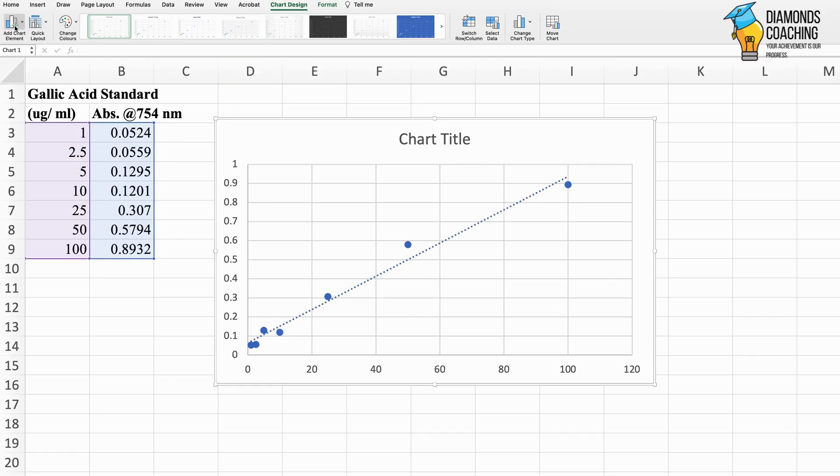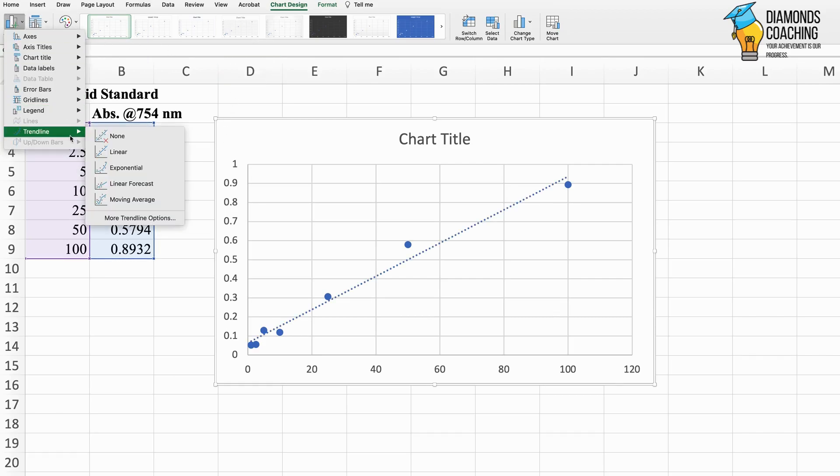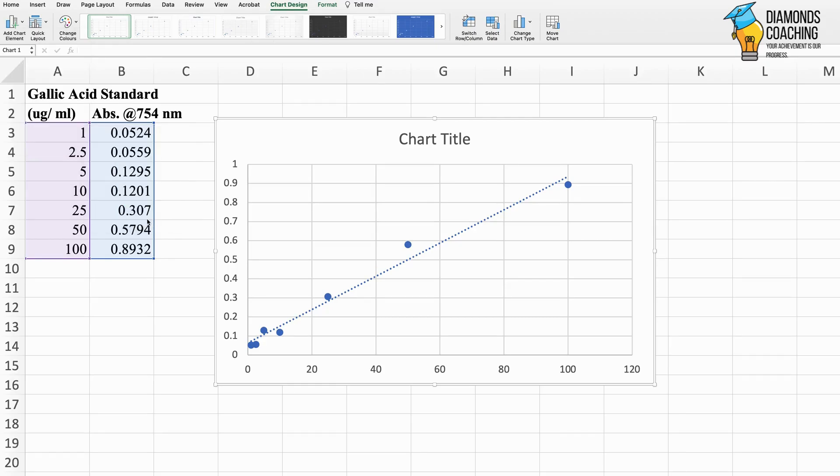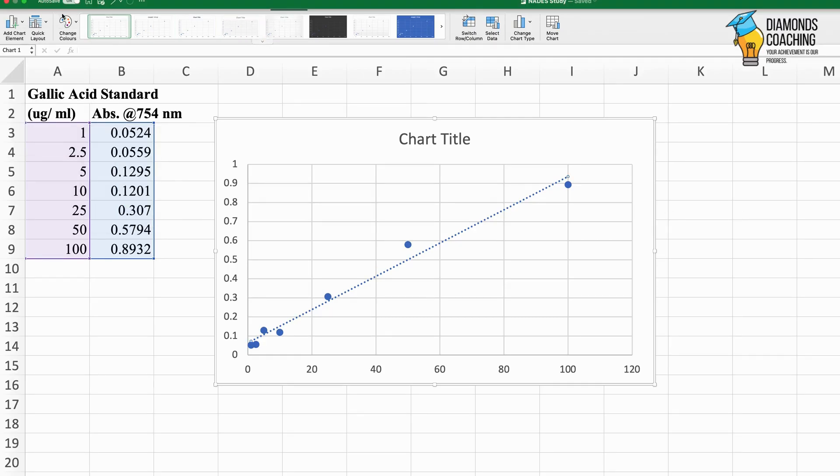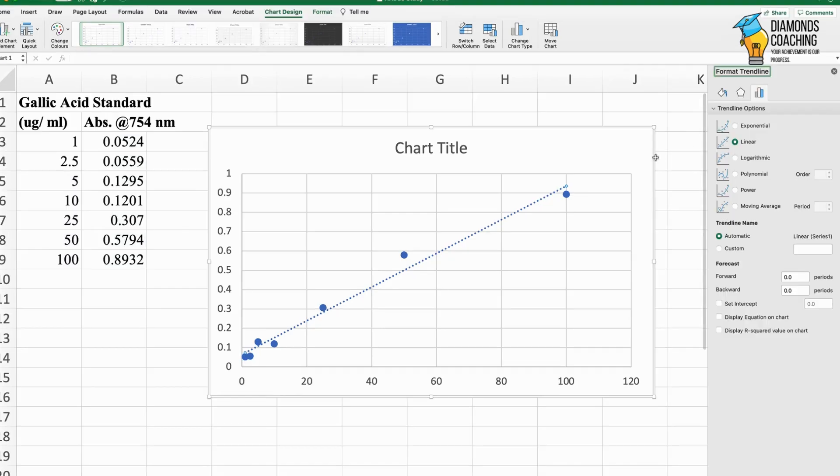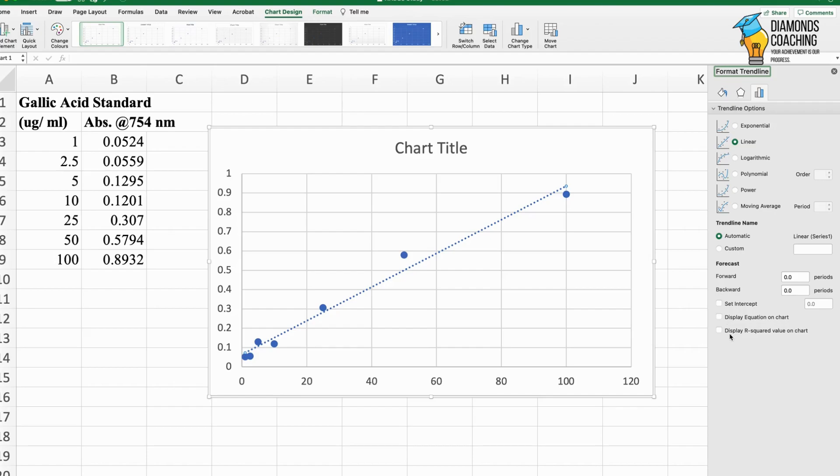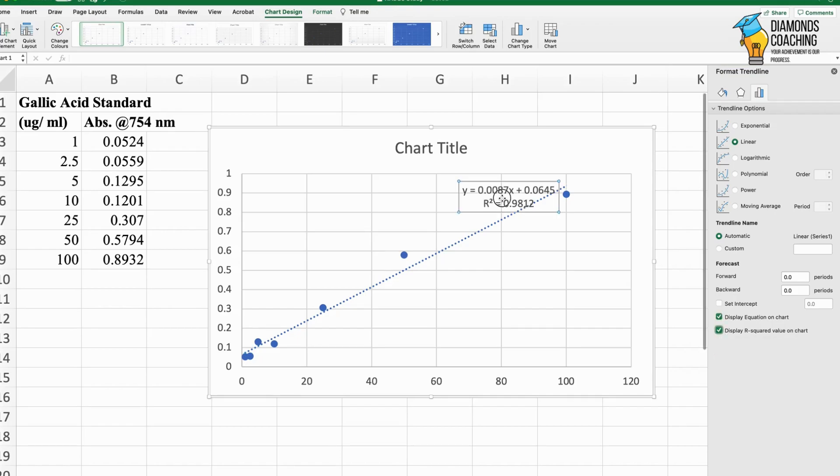Then I will go to that option again and click on more trend line options. Now on the right side you can see the format trend line option. There is a bar displayed on the right side.